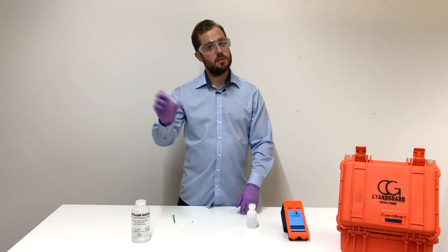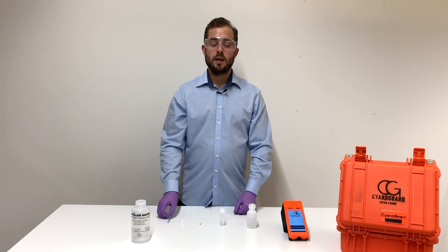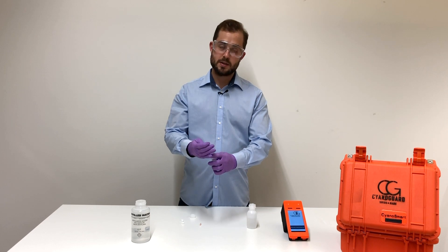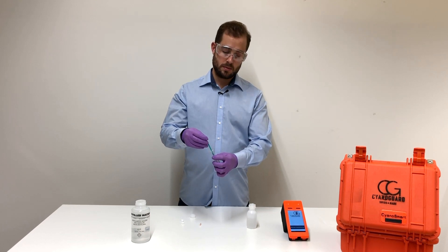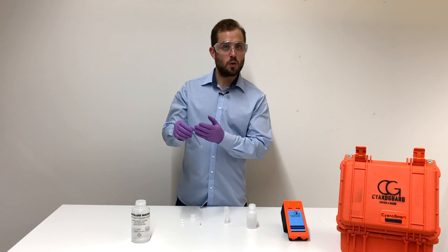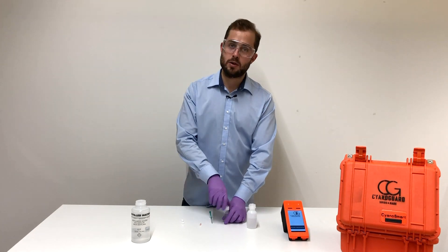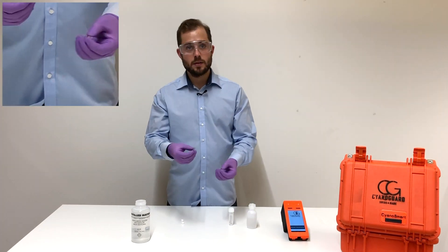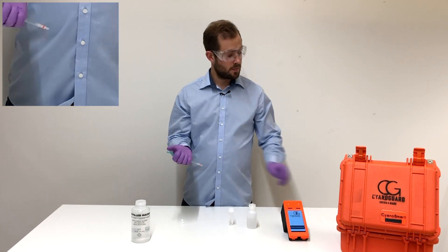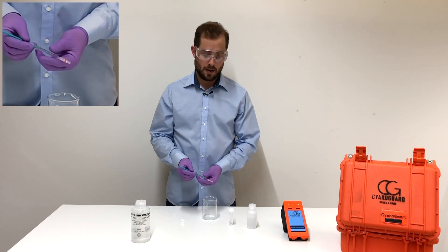Now close the vial and shake it gently. Take up exactly one milliliter from the sample vial we prepared in the step before. Make sure that there is no air inside and it's exactly one milliliter. Close the vial, then connect the syringe to the cartridge and press the entire content of the syringe through the cartridge in exactly five seconds.